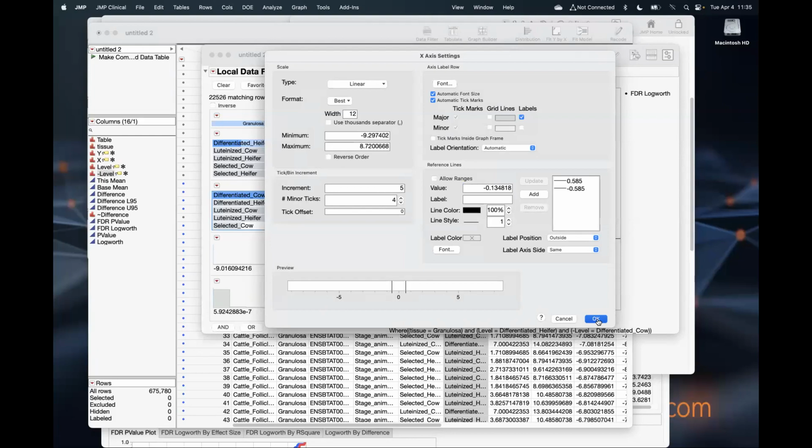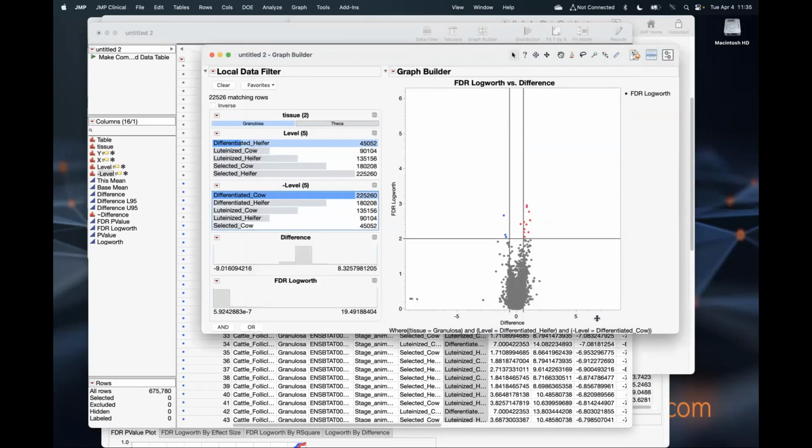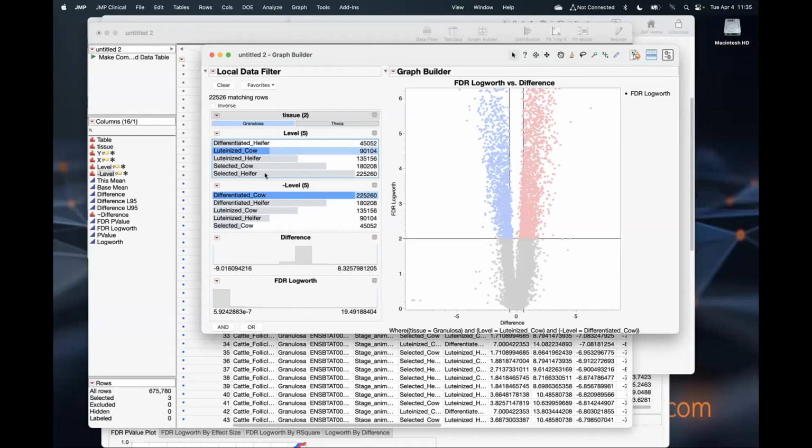So we're roughly at log 2 of our differences because we're in log space. And now I've got my goalposts, right? So now we can see those that might be interesting here and those that might be interesting here that are underrepresented or overrepresented relative to cow.